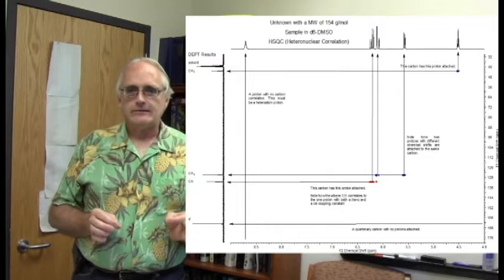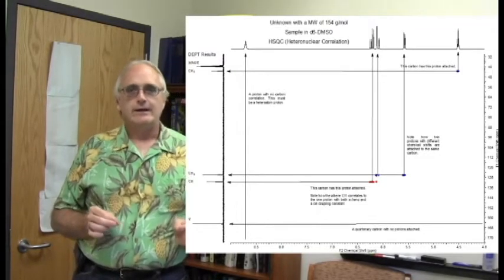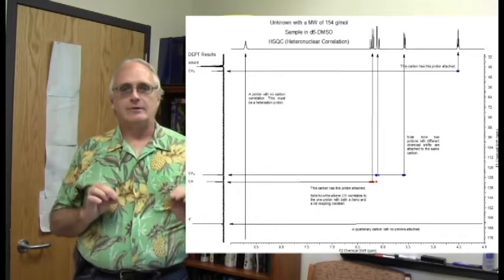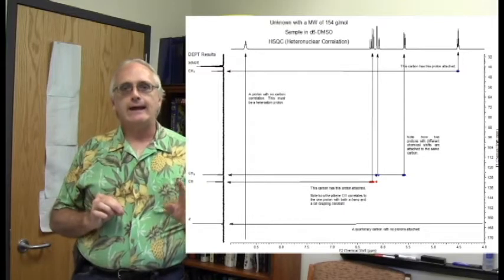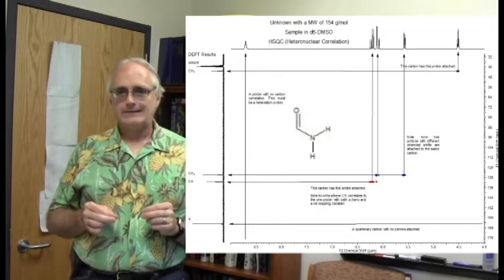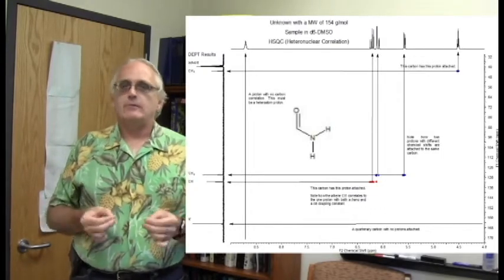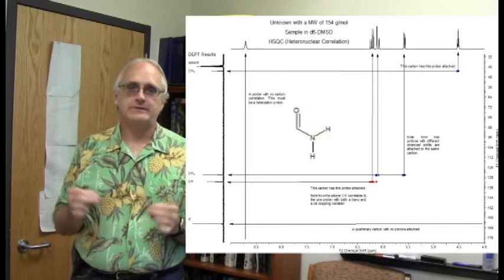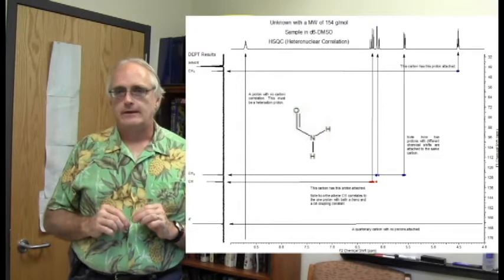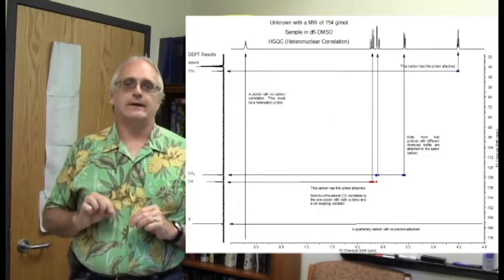It suddenly starts to dawn on us, the heteroatom may not be oxygen. Because think about nitrogen for a moment. Nitrogen can be bonded to a carbon and take 2 hydrogens. That's kind of interesting. That would get us, if it's a carbonyl, an amide, which would have an unusual chemical shift. And we have a carbonyl that has a consistent chemical shift with that. But that leads to one other very fascinating puzzle.